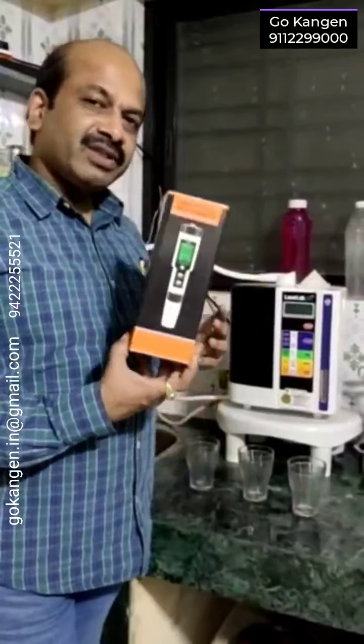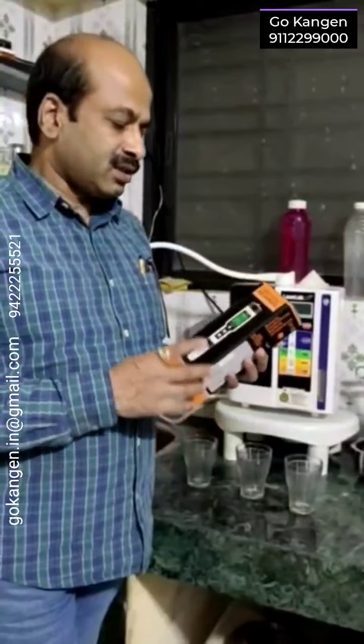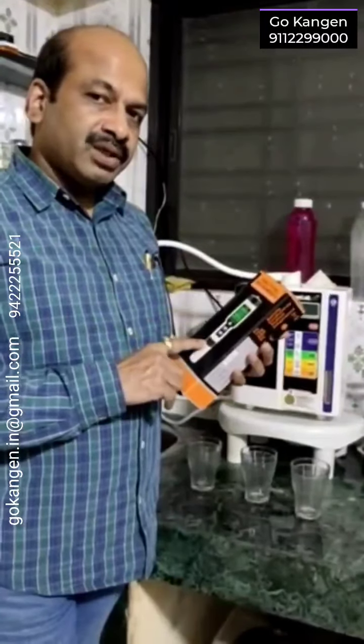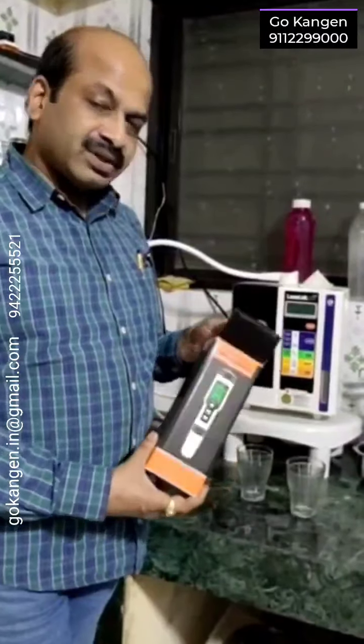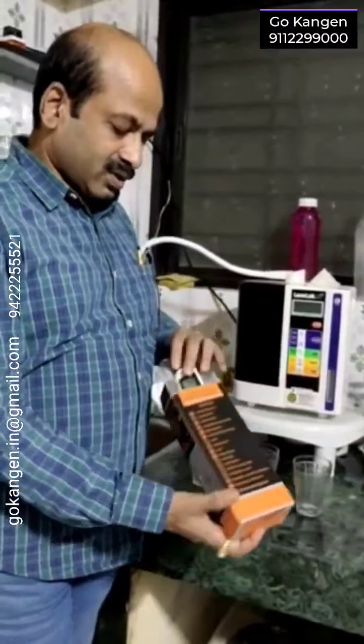Hi, finally we have received the most awaited 4-in-1 meter. This has hydrogen as well as ORP, pH and temperature. So now we are going to unbox it and test it, whether it is really working or not.